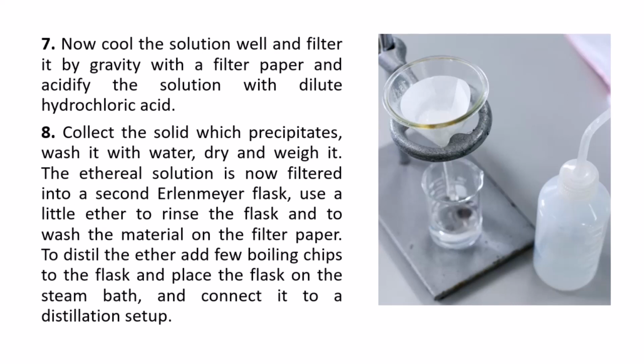Now, with the ether layer, you are going to have to filter the solution into a second flask, and after rinsing, sometimes it's better to use some amount of ether to rinse the content of the layer to make sure that all the ether solution is being filtered off into a different container.